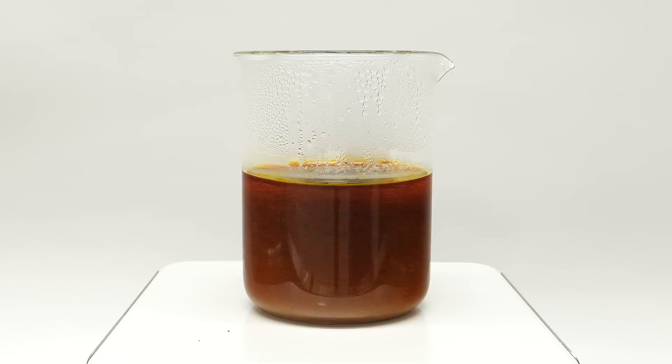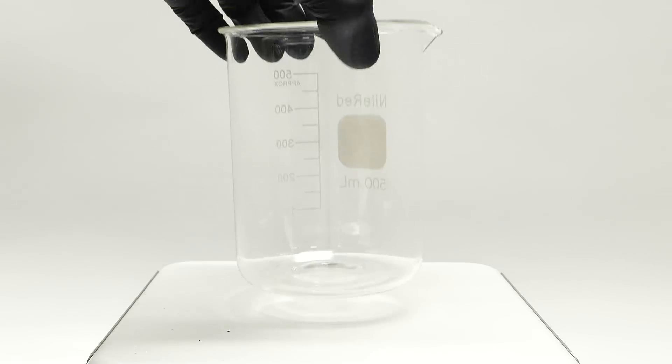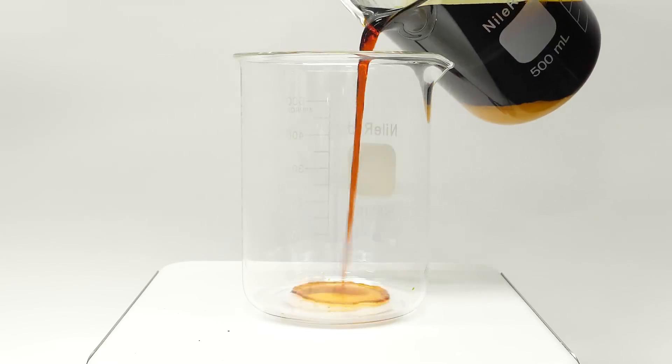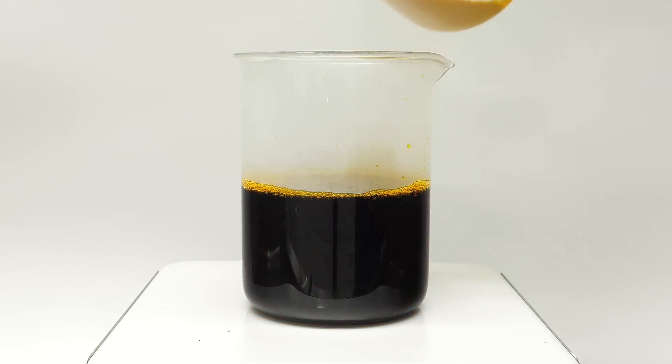I'm eventually left with this dark orange mixture, and when I turn off the stirring, all of the unreacted sulfur sinks to the bottom. To get rid of this sulfur, I'll get another beaker and I'll pour out just the dark liquid. I'll also add a stir bar.